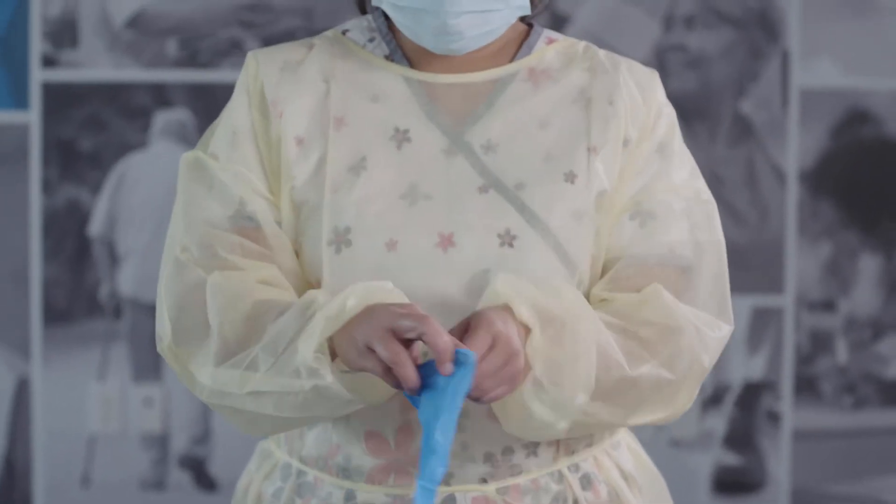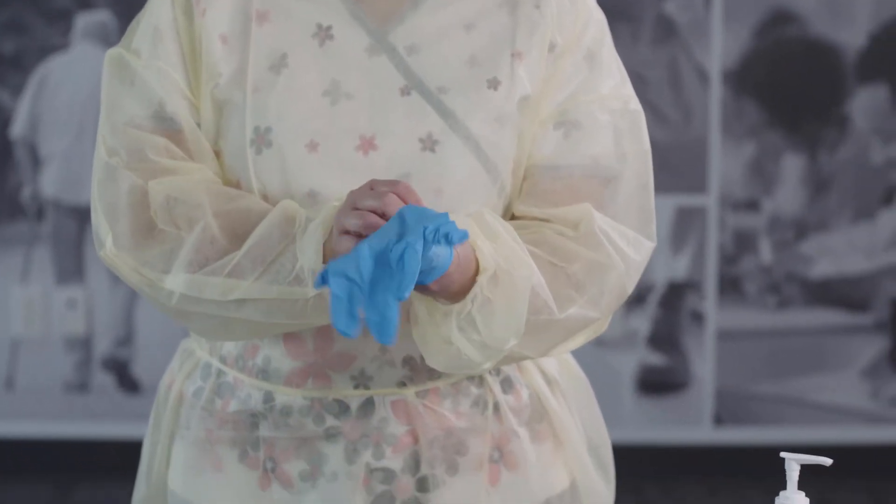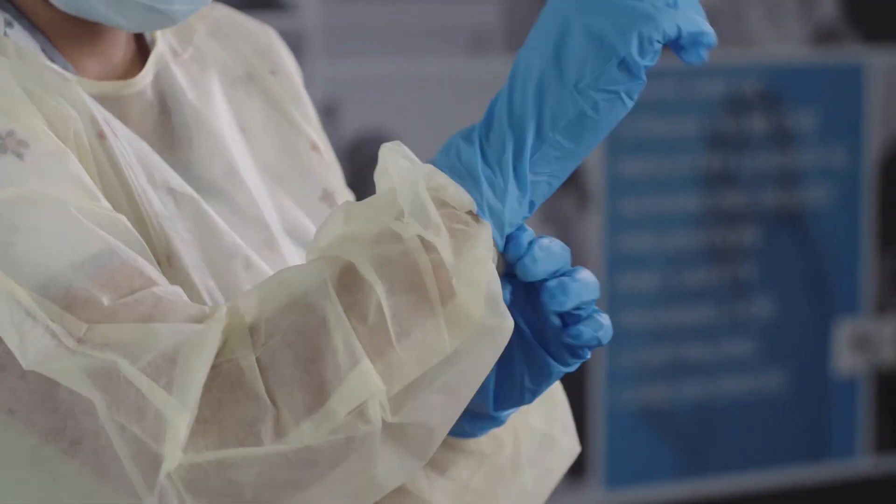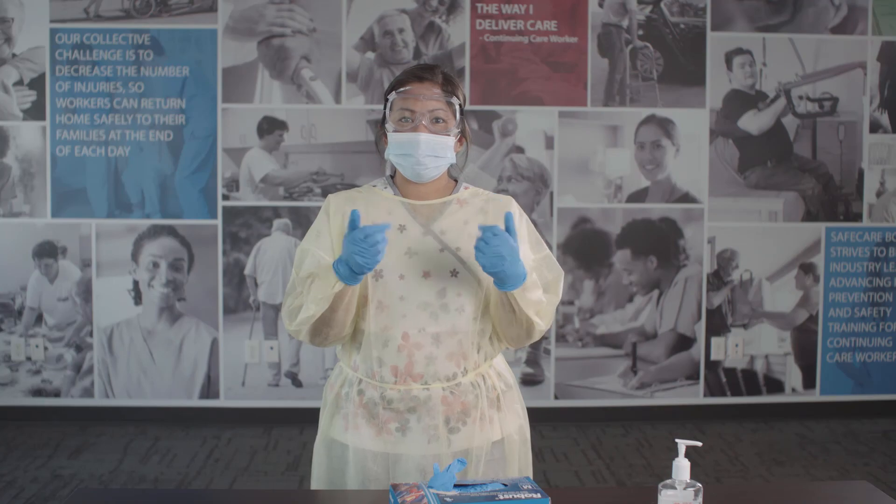Last, put on your gloves. Extend the gloves so they cover the cuffs of the gown. You have now completed the donning procedure.